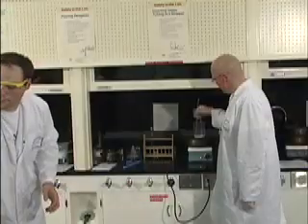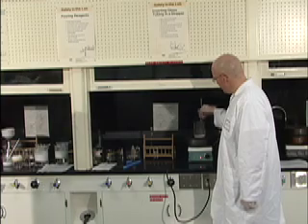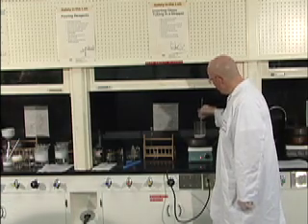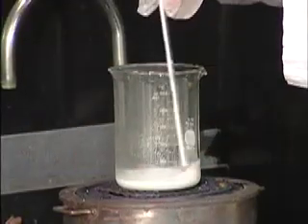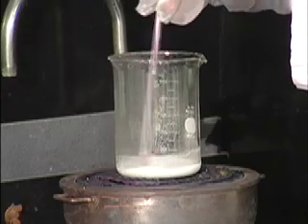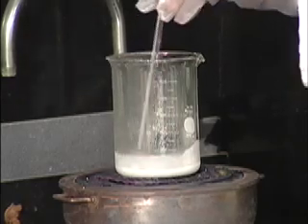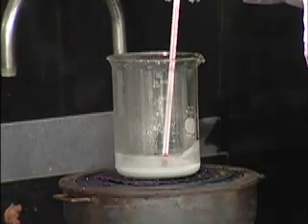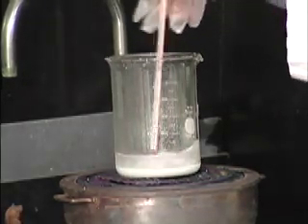We're about 20-something now. Between 80 and 85. I stir it like this. Exactly. Till it gets to 80? Yeah, 80 degrees is where we want it. Oh, it's fairly warm already. 35. It heats up pretty quick.